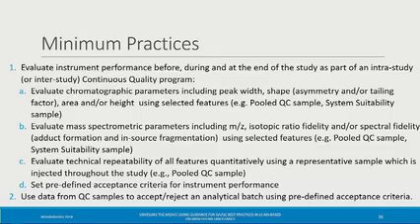So now I will say my personal opinion and what we do in the lab. I agree with you, and we use pooled QC to monitor instrument performance. So we normally pool it post-extraction, and we monitor our extraction using internal standards across all study samples. That way I know if my variability is coming from the extraction process, from the instrument, or from both.